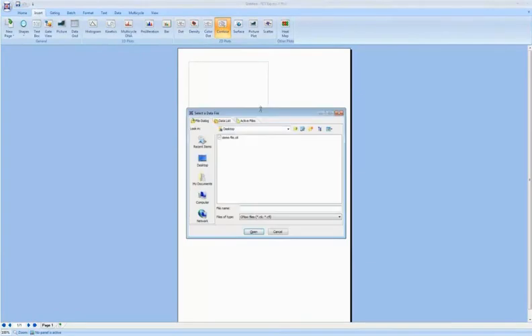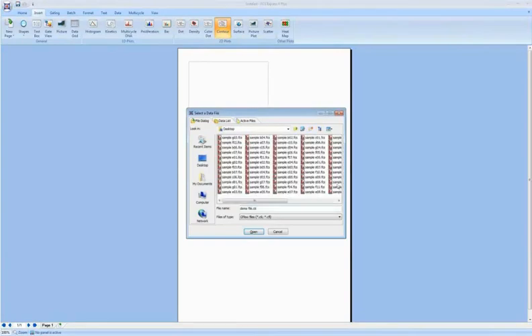It asks me what file do I want, and I'm going to select the demo data file and double-click on it. Now at this point, it didn't open a plot because it knows that there are many files inside that C6 file. Now this is important to note. There is no other third-party software that can do this, that can open up the C6 file and ask you which of the contained files are in it. With other software, what you have to do is go to the CFlow software and export multiple FCS files. But FCS Express can just read it from the C6 file. So I'm going to choose one of the samples contained inside.